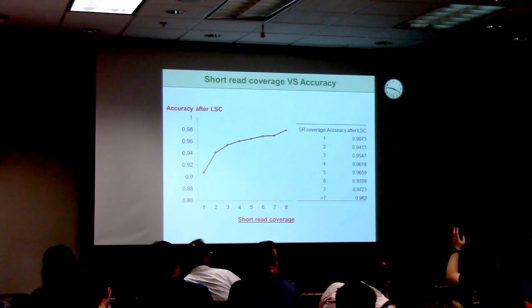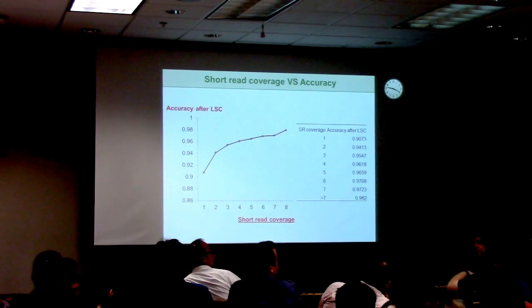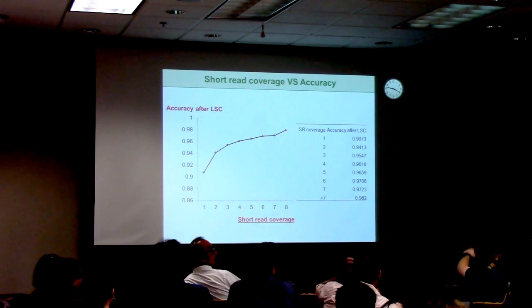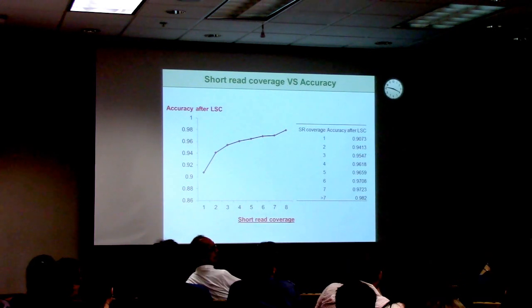Okay. So when you do the alignment, do you relax your insertion penalty? Because it might have really been a TT there. You're right, but actually we do not change any parameters in the aligners. We just use the default setting. So even if the accuracy goes up, it might be biased toward... Yeah, it could be. Okay. But overall, I think it looks fine.